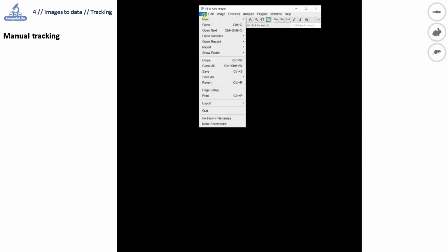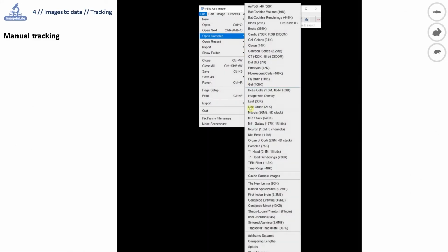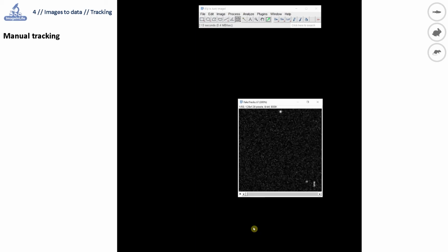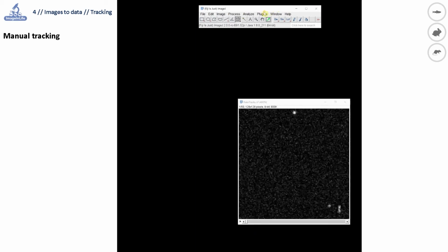Once the data is acquired, it is time for the analysis. Some pre-processing, like background subtraction or deconvolution, can actually help with fluorescent images before starting the tracking. Then there are 2 solutions: either manual tracking or using some kind of automated solution. If you have only a few particles, or if an automated solution is too challenging, manual tracking can offer very reliable results. Let me show you an example in Fiji using the manual tracking plugin.